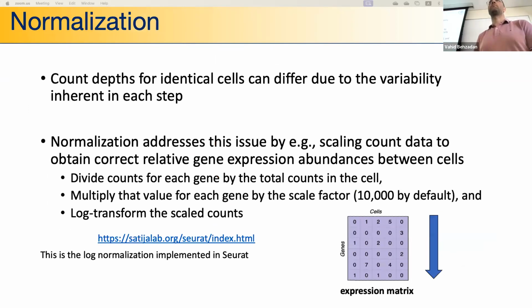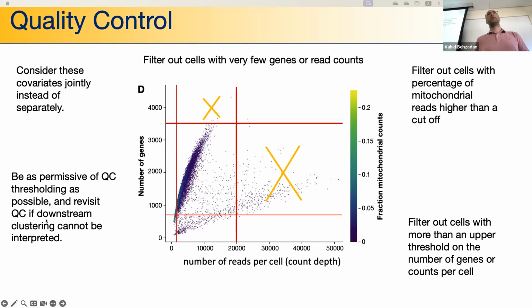How do you determine the threshold? It's, as I said, trial and error. You start with a low threshold, and then you keep changing it if the results are not good. So it'd be different for each experiment, because as I said, we don't know what cells we have. I'm going to explain how we identify cells.